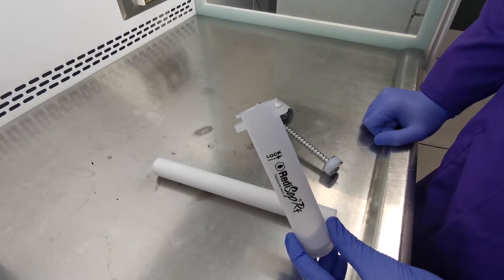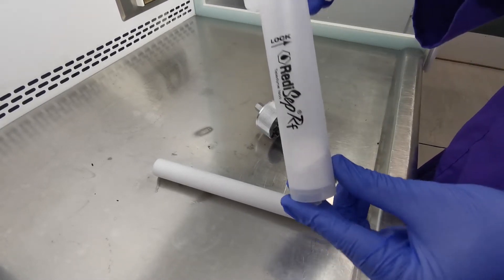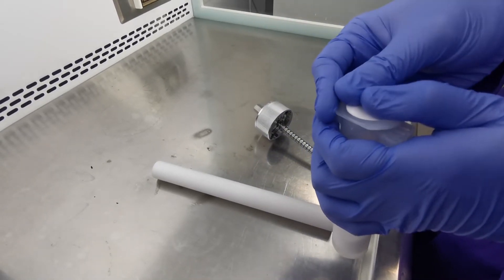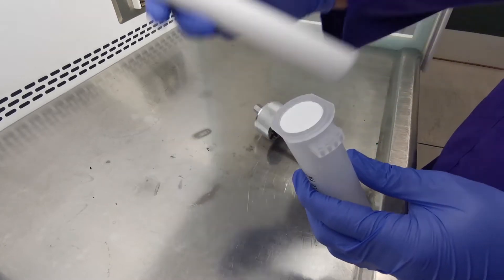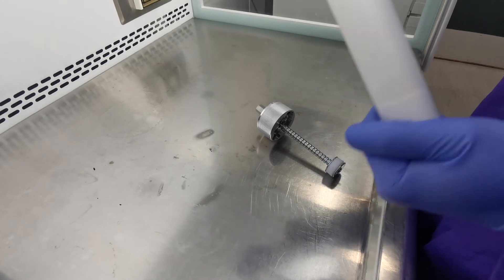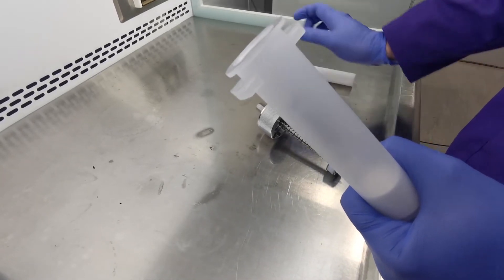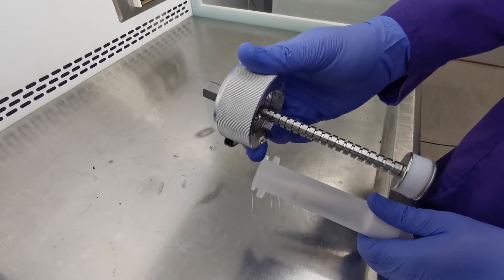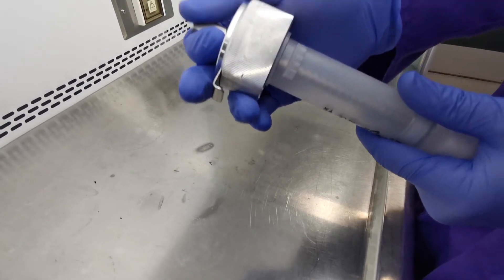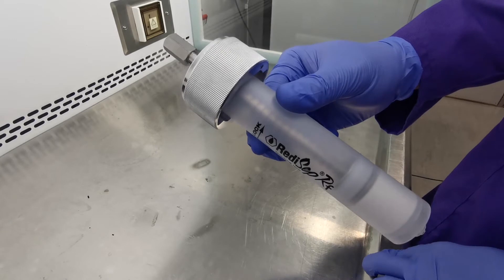Once you've absorbed your reaction mixture onto silica or celite, you then place this within the empty cartridge. We then use the frit, push that into the top of the cartridge, and then use the plunger to pack this down. This is then ready to load onto our Combi Flash Next Gen using one of our solid load cartridge caps. We simply insert the plunger to the bottom and firmly clip this in place and we're now ready to go.